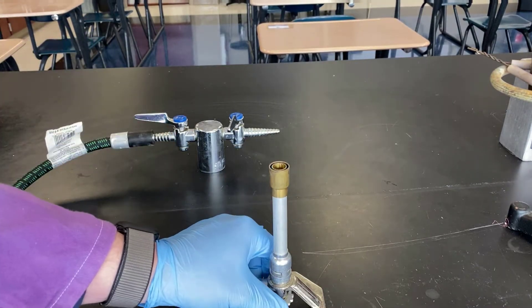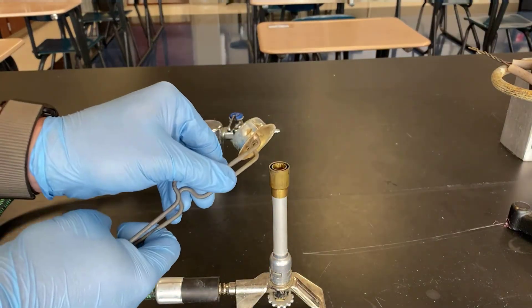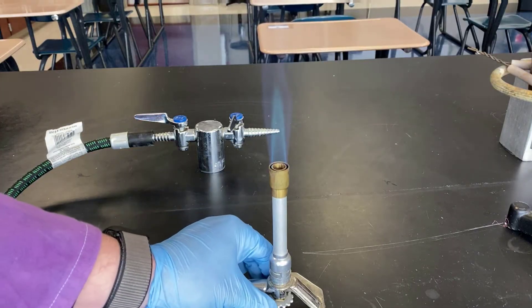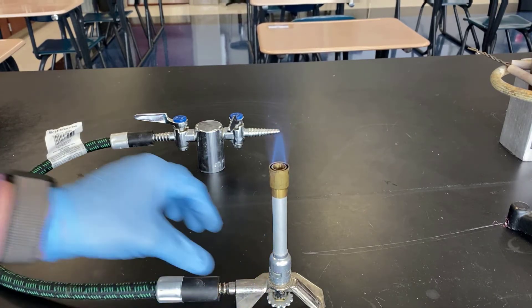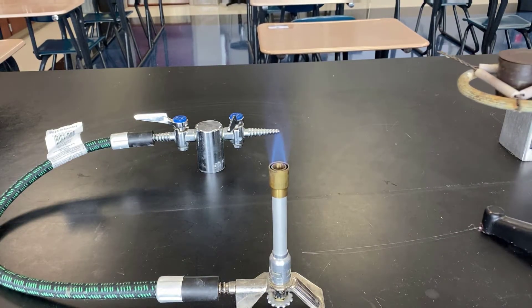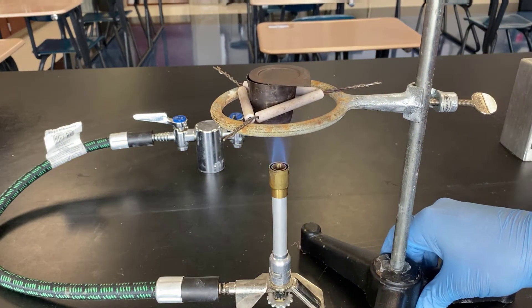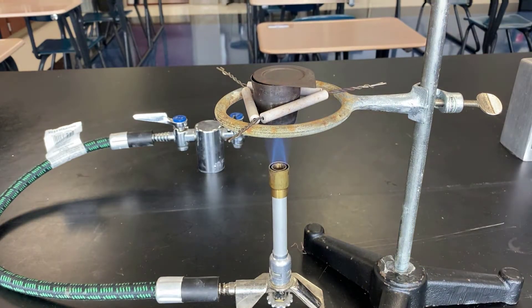We must have oxygen. There are many things that can go wrong that can cause us to get a low yield. Notice I have an opening, and so oxygen should be able to get in. The problem is magnesium oxide can also get out.